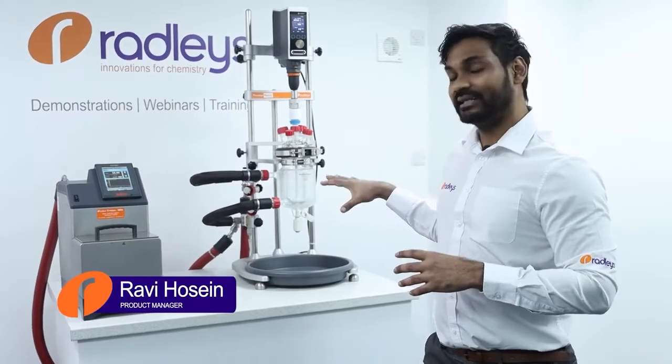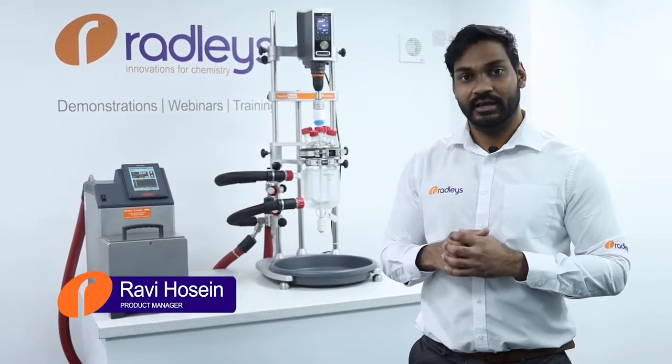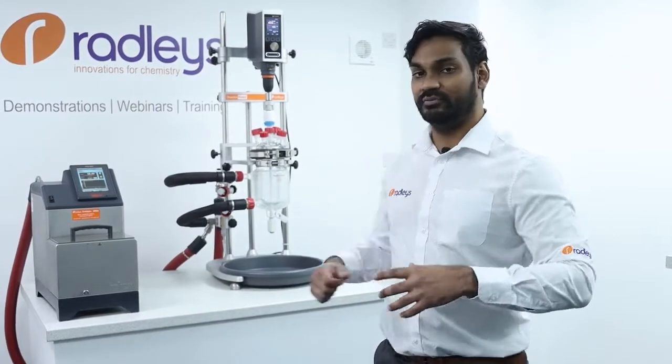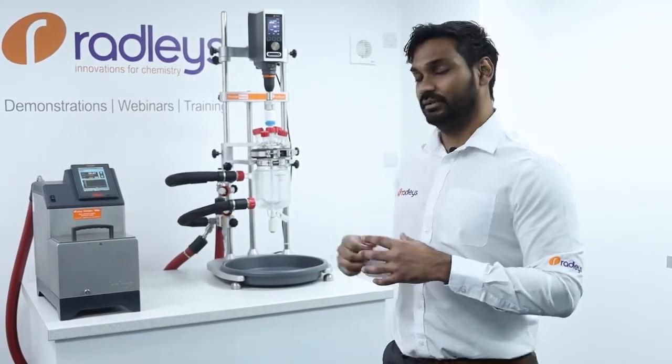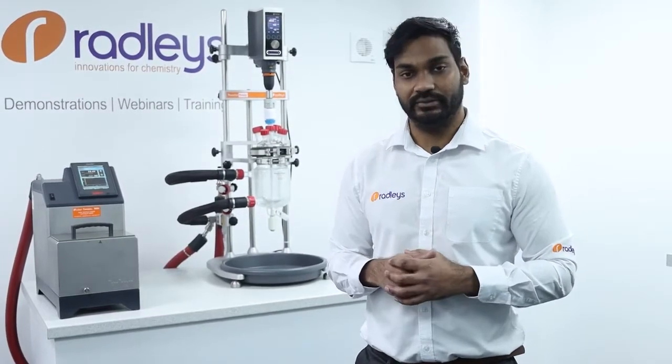Today I'm going to show you how to set up your reactor ready jacketed lab reaction system with a circulator ready for use. Then I'm going to show you how to drain the thermal fluid from the system and swap the vessel to a different one — for example, if you wanted to scale up or scale down your chemistry.